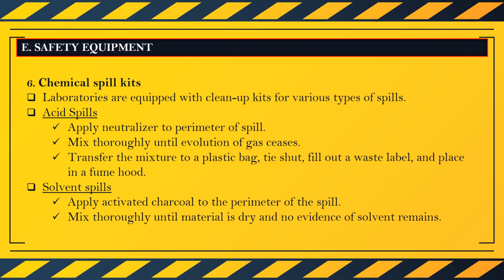Okay, number six, chemical spills. Laboratories are equipped with cleanup kits for various types of spills, in anticipation and for prevention of further harm to the laboratory staff. And that's exactly why, class, it is imperative to wear the appropriate PPE when working inside the laboratory and dealing with spills such as chemical spills.